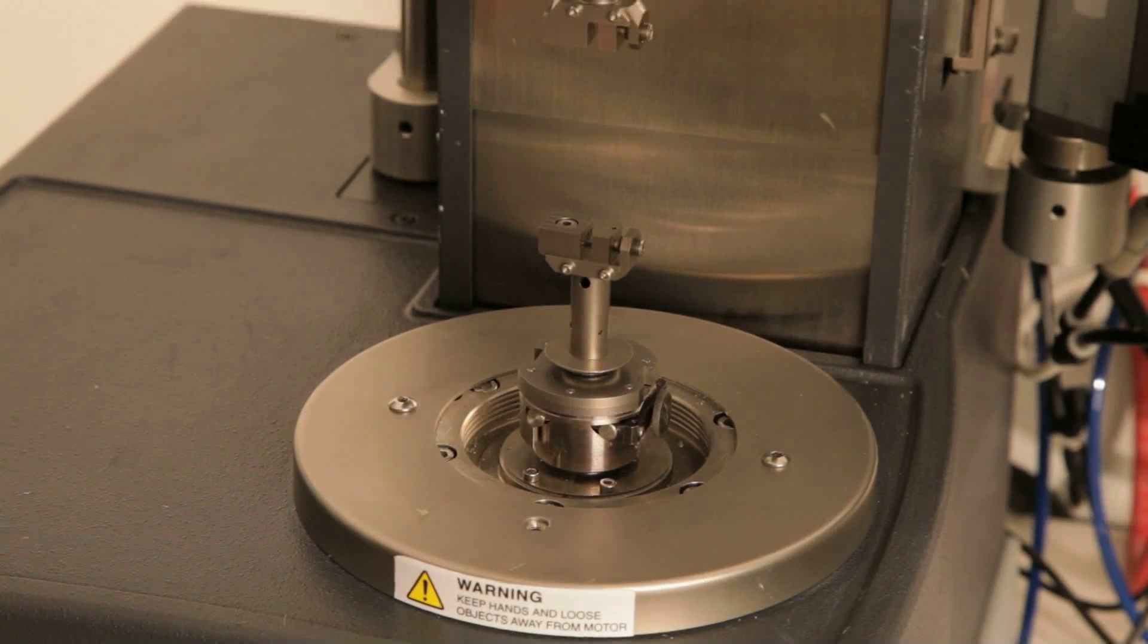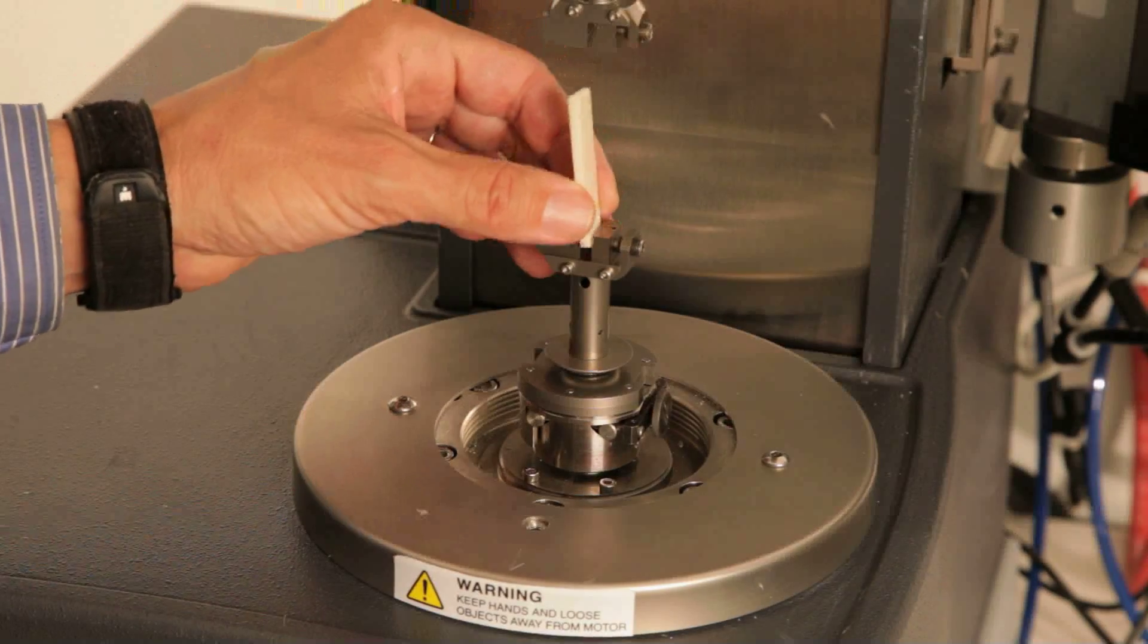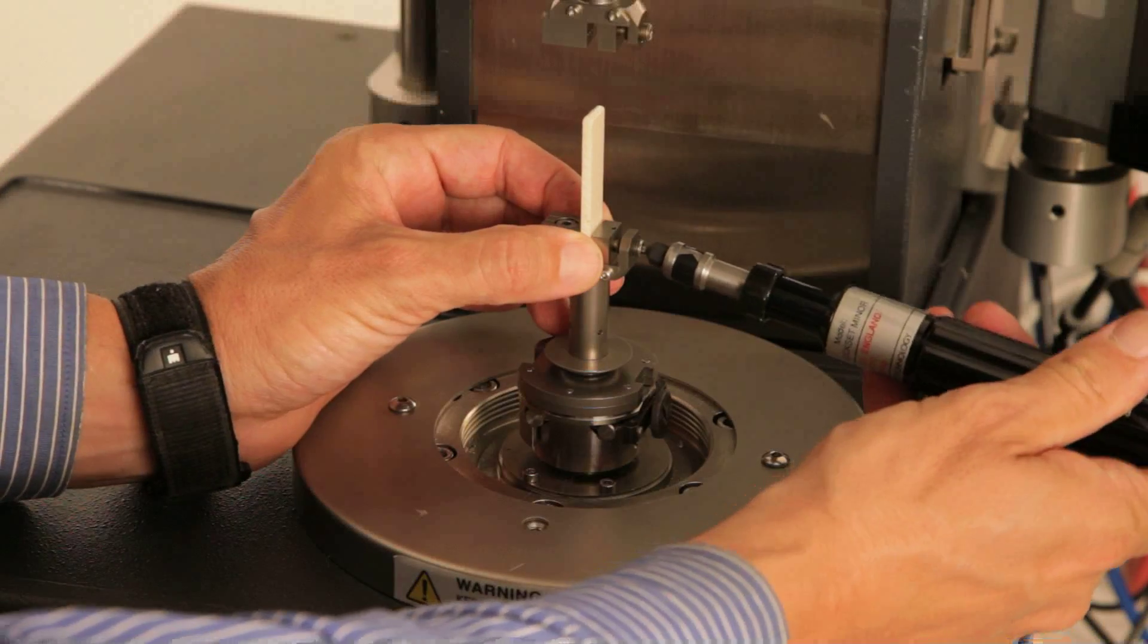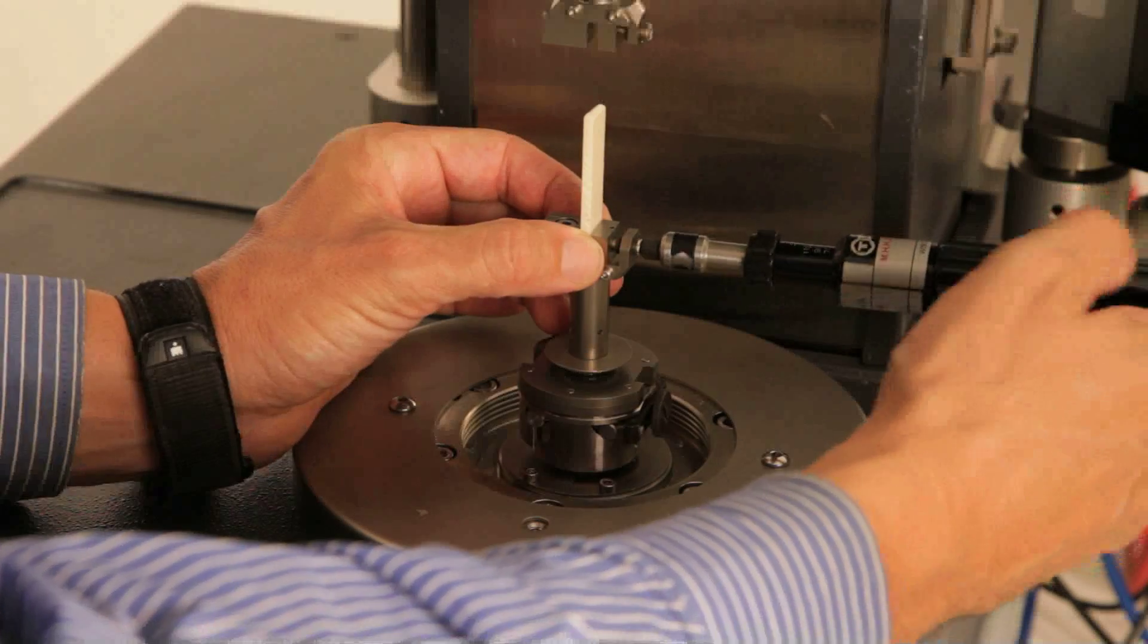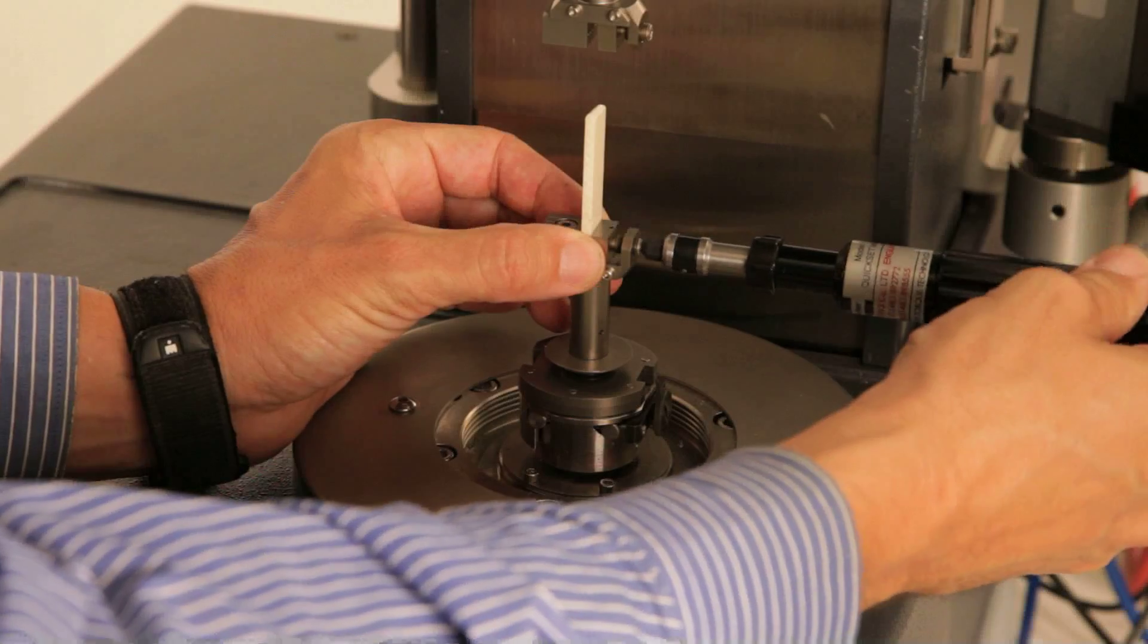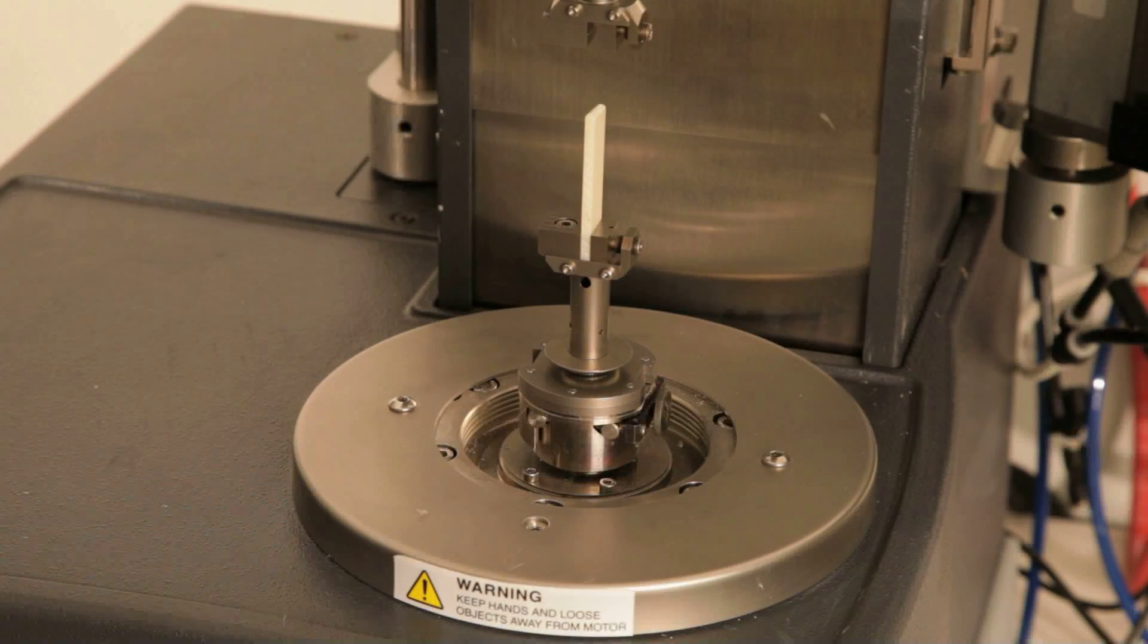Now we can load the polymer. Insert the sample into the lower clamp. Center the sample using the reference lines on the clamp and then tighten the sample in place. Be sure to align the upper and lower fixtures with the sample to release any pre-torque on the sample.